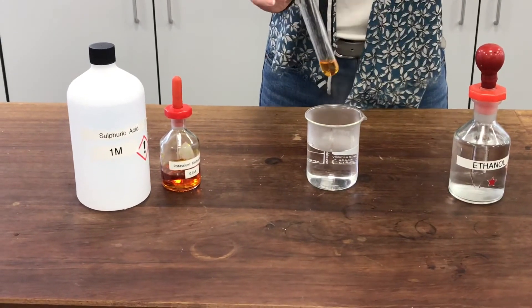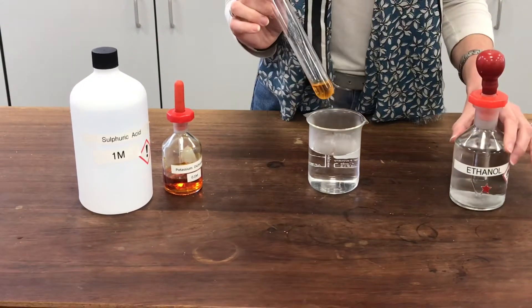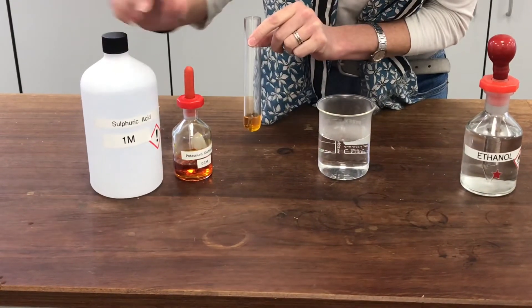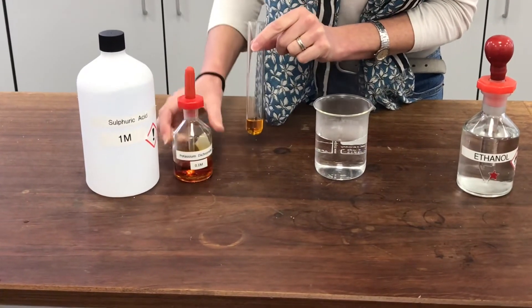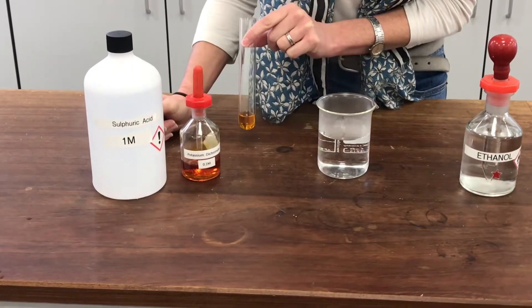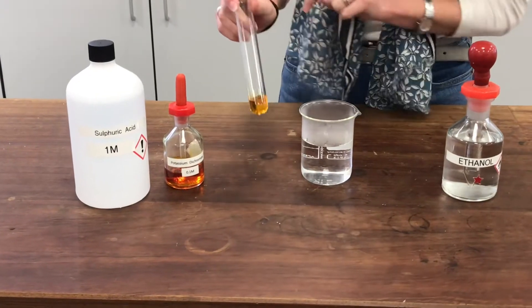In this reaction I'm going to show you what happens when we oxidise ethanol. In this boiling tube I've already put a mixture of sulphuric acid and potassium dichromate. Potassium dichromate is my oxidising agent and it needs some sulphuric acid with it so that it works properly. That's already been prepared in here.